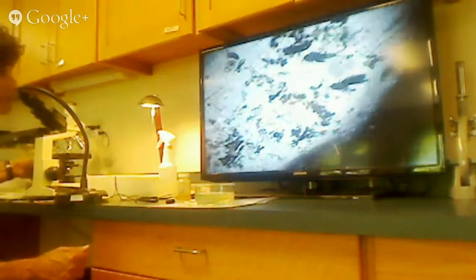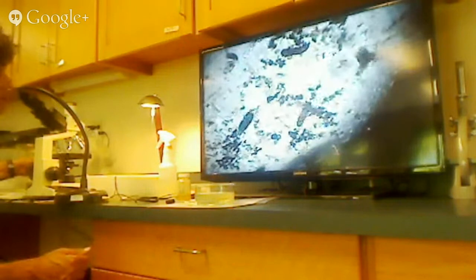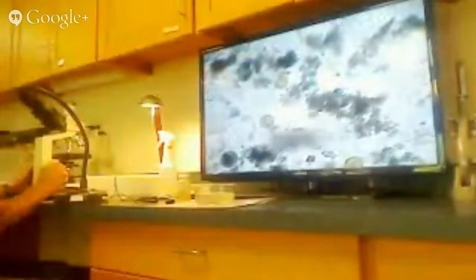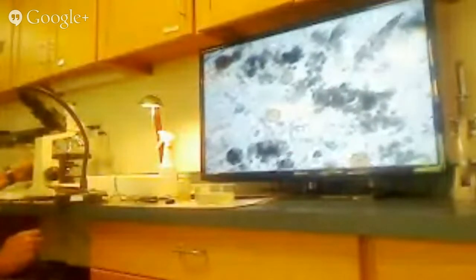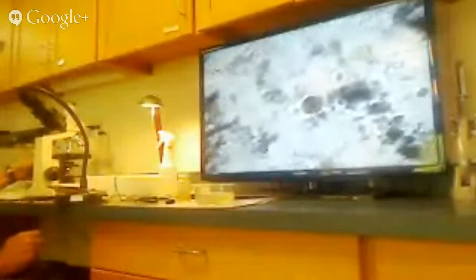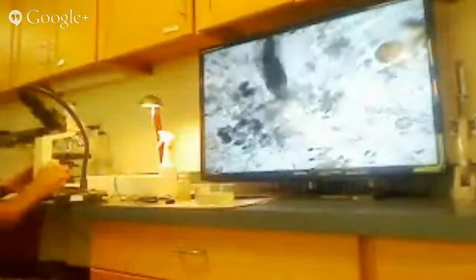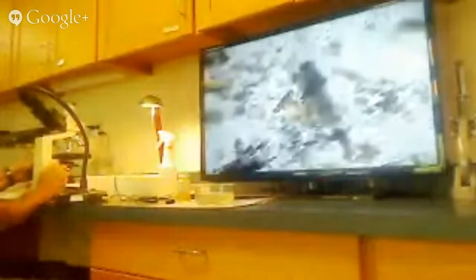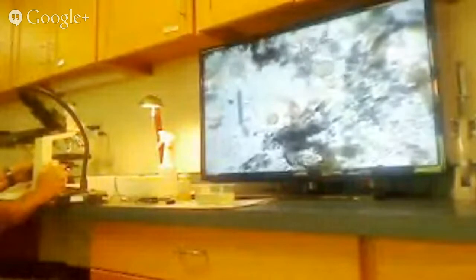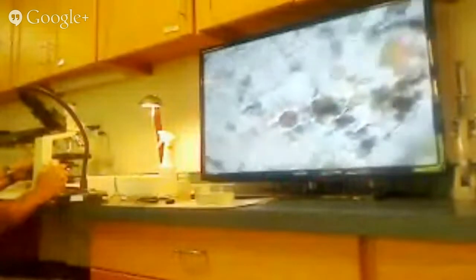And you notice that all of these animals, and for that matter, most of the plants, but the animals are fairly clear to the naked eye, even with the microscope. I'm going to bump up the power now, and you can start to really appreciate some of the beautiful forms that the phytoplankton take on. And these zooplankton are moving through. They're just like race horses or something, moving through the space. And let's see, you can't really get them to hold still very readily. We have to put them on a different type of slide in order to really have that look.